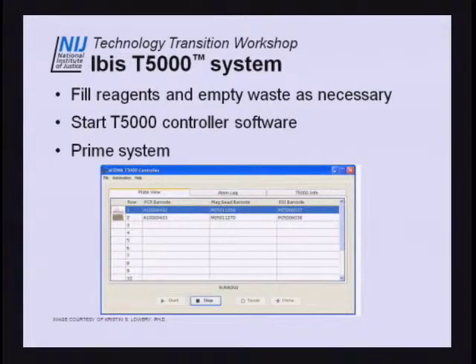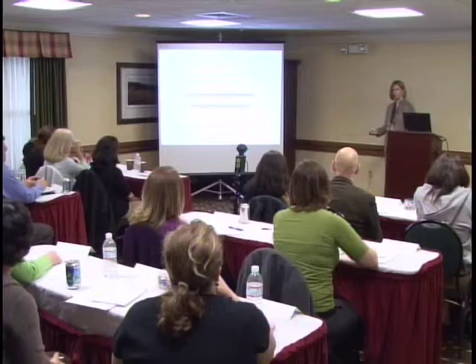We'll then fill the reagents and empty the waste, and we'll start the T5000 controller software. Since we'll have just added reagents, we recommend priming the system, which is just selecting this button and following the directions on the prime. That ensures that there's no water or no bubbles in your system water or in your reagents that could cause problems downstream.